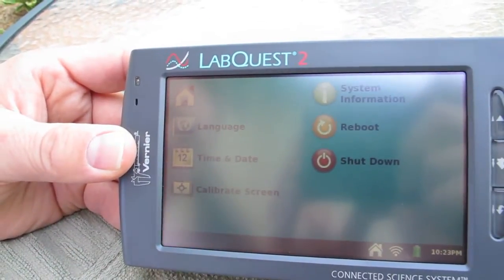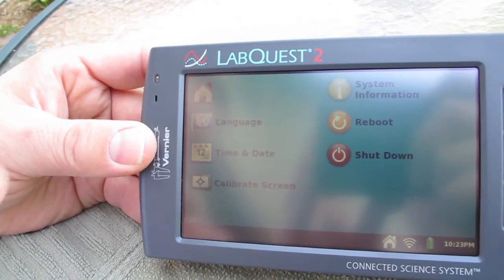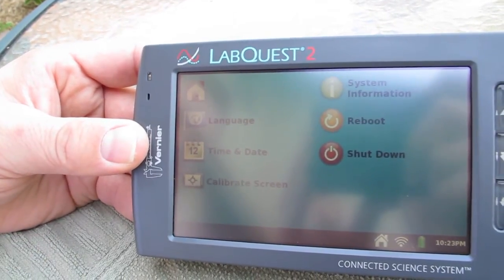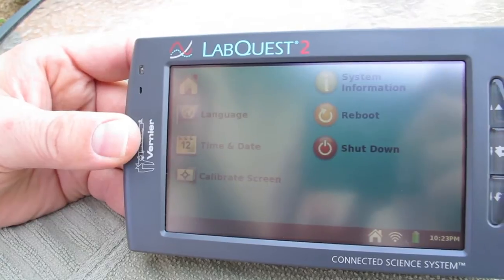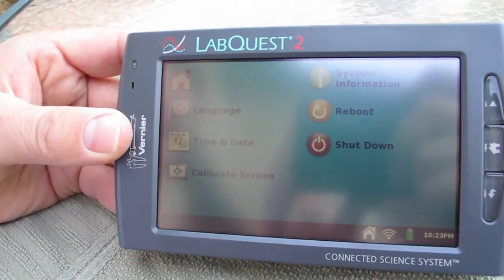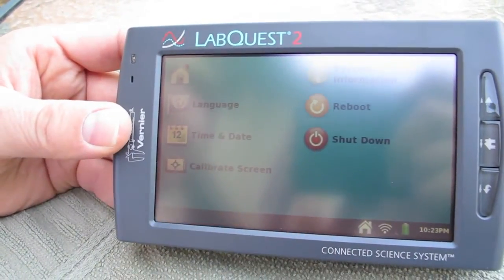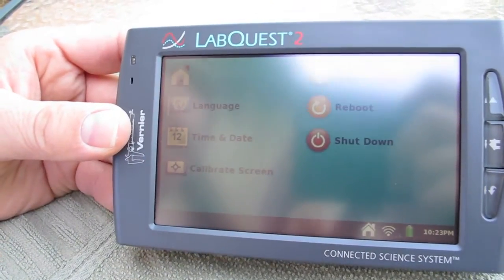You know what this is missing? Any touch screen comes with those little chamois cleaners. I thought you were going to say Angry Birds. I'm surprised Angry Birds isn't on this. It's on every other device. It would be kind of cool because you could actually do science with Angry Birds on this device. No, never mind, it's been done. Well, it's not running Android, I think that's the main thing.